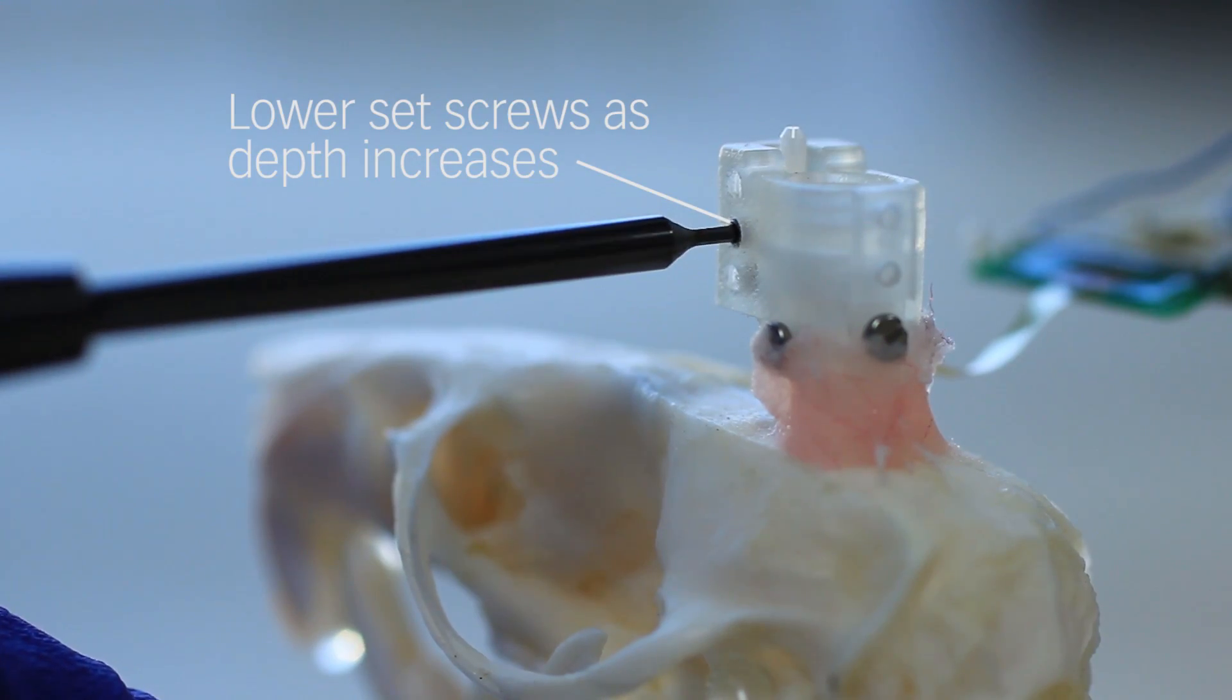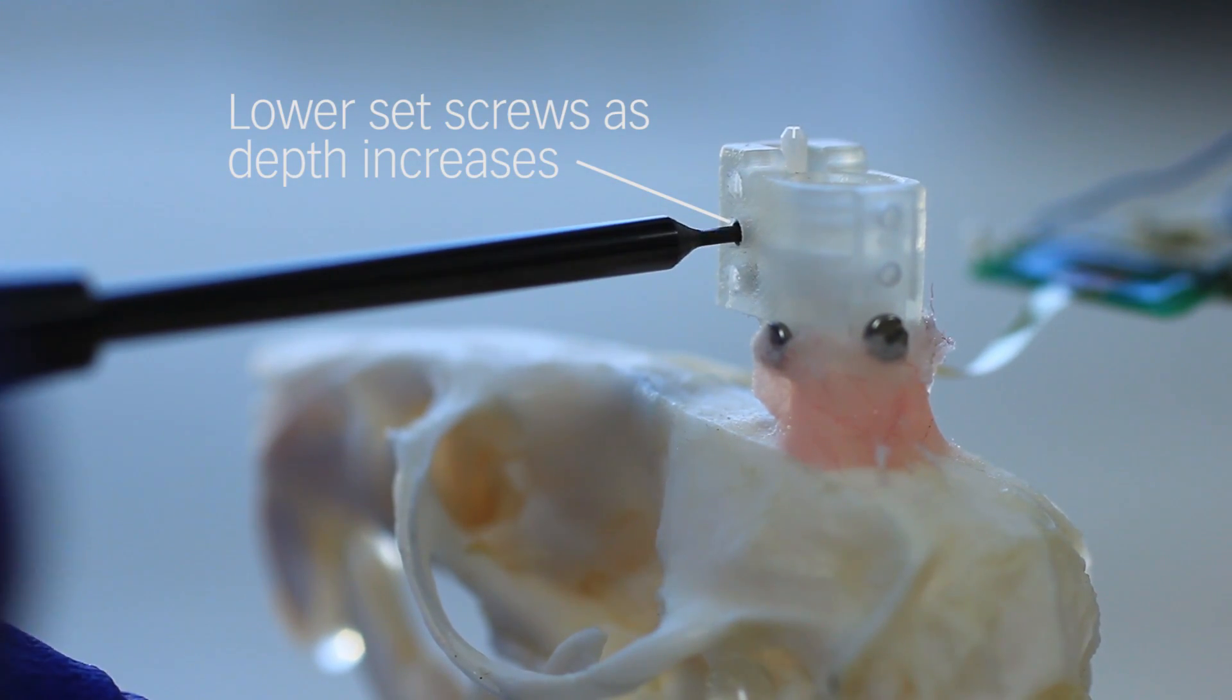Once probe depth is set, tighten the set screws to secure the ferrule housing at its new position. Both set screws must be engaged for optimal stability.